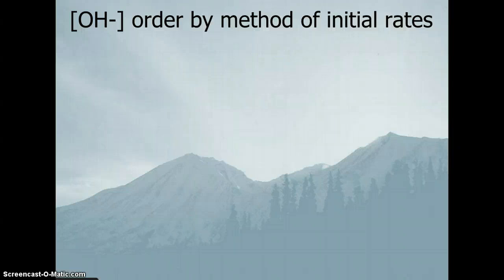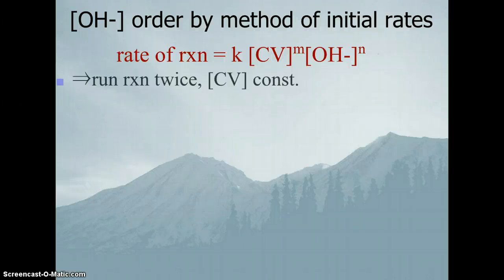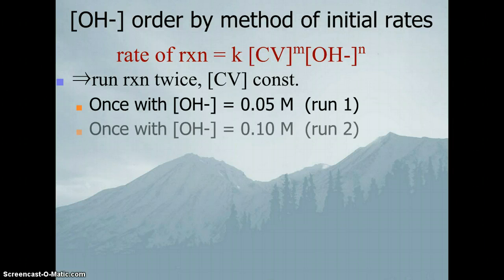There are two methods for determining orders of reaction, and we're going to use both in this experiment. You need to keep them separate because they are very different in terms of method. To determine the order of reaction in hydroxide ion, we are going to use the method of initial rates.